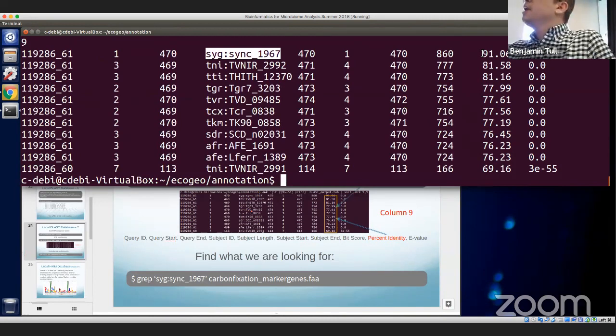Yeah, it's column 9, and then I have to double check what the comma 9 is. It's column 9, and then sorting by that particular element too. Yeah, I have to double check that for you.